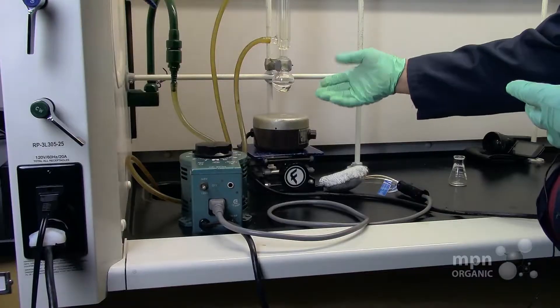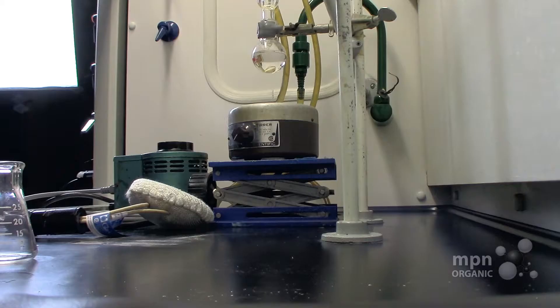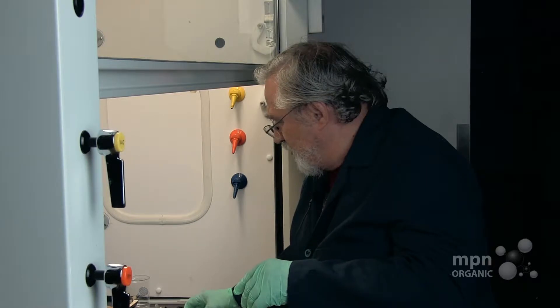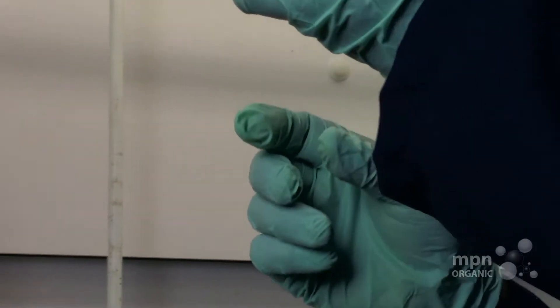Building on our skill at setting up a reflux condenser, we're going to take this same sort of building block and turn it into a distillation apparatus. We're going to need a couple more items to do this: a three-way connector, which you have in your equipment, and a distillation takeoff.